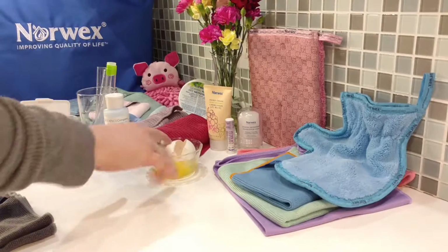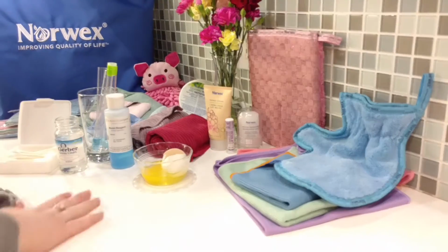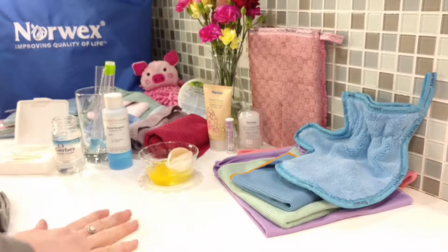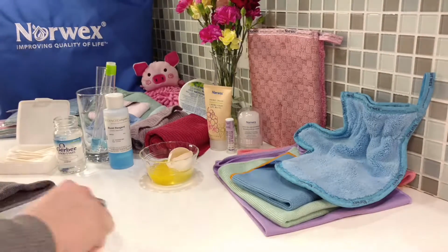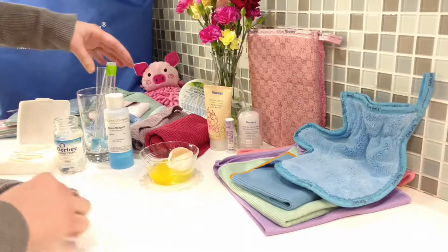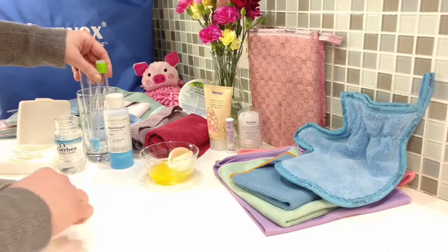And so you crack an egg and you get all the goo on your countertop and it's disgusting, right? And dangerous. So, just going to take a Q-tip, dip it in some sterile water, just so it picks up more of this protein. And we have 3 vials of the Biuret reagent.